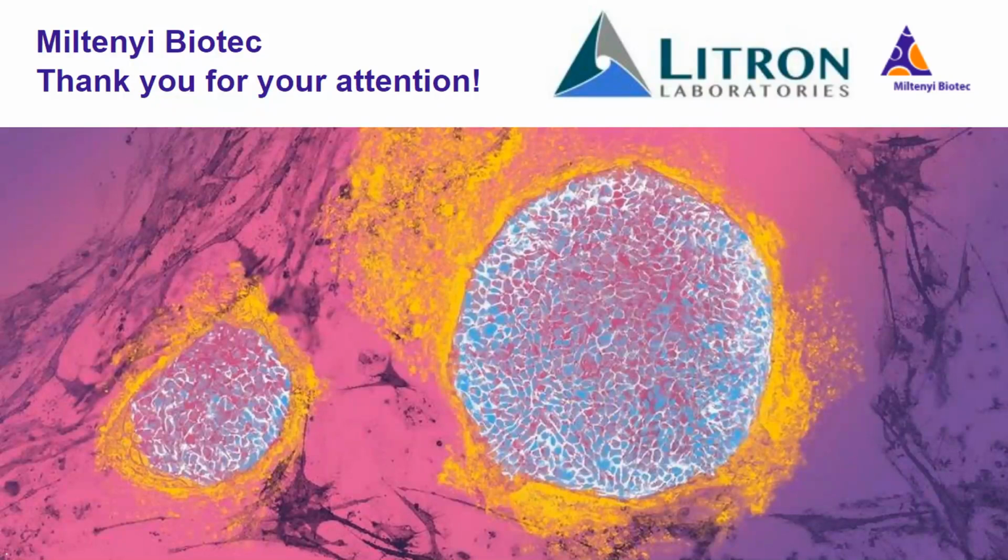But to go into a little bit more detail as to how we actually fit it in there, you heard me talk about a low blood volume requirement. For this Pig-A assay specifically, you really only need a maximum, it's somewhat species dependent, of about 300 microliters of blood. So it's not a very large ask in terms of the volume of blood that you would need. That's fairly simple for you to get from numerous routes in rat or mouse.